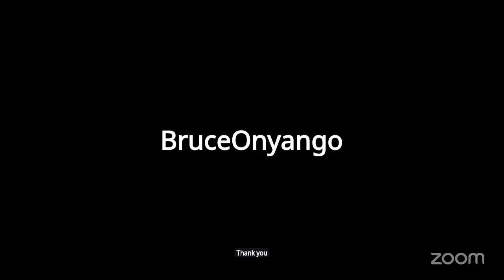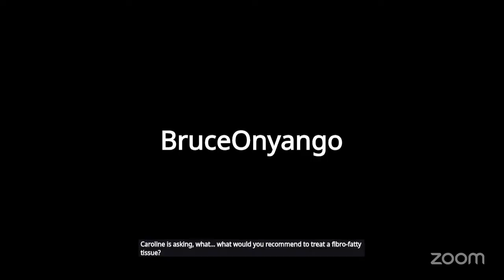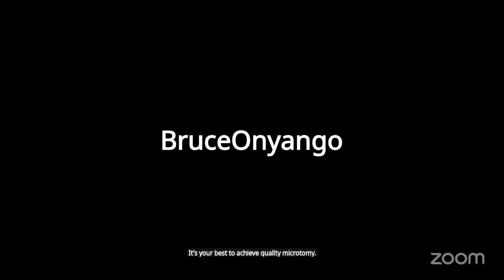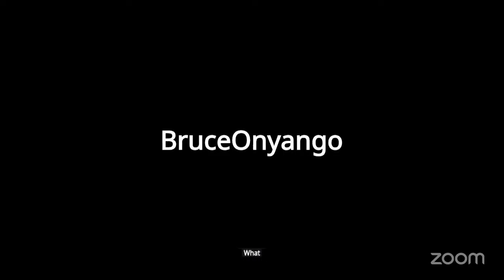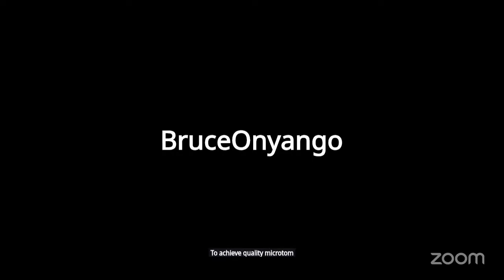Thank you. The second last question from Caroline Moy. Caroline is asking, what would you recommend to treat a fibrofatty tissue, e.g. breast, to achieve quality microtomy? Okay, fibrofatty tissues, that one, you have to deal with them.